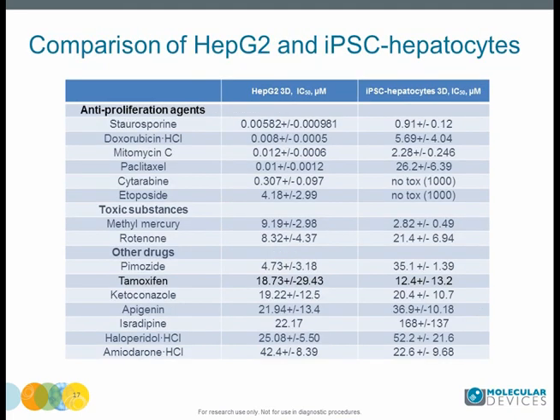We also compared effects for selected compounds on spheroids made from transformed liver cells. HepG2 spheroids were larger in size per same cell number plated, since HepG2 spheroids appear to continuously grow in culture during compound treatment. Also, there was a marked decrease in the size of HepG2 spheroids as well as a decrease in total cell number, which was in contrast to the non-dividing iCell hepatocyte spheroids. A comparison of IC50 values for compounds between the two cell types is given in a table.